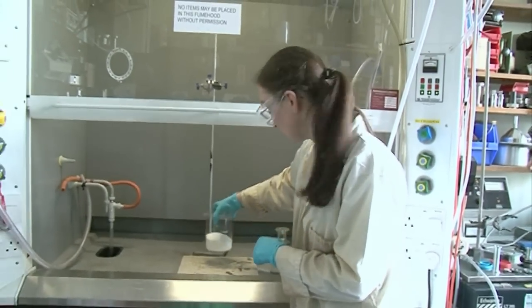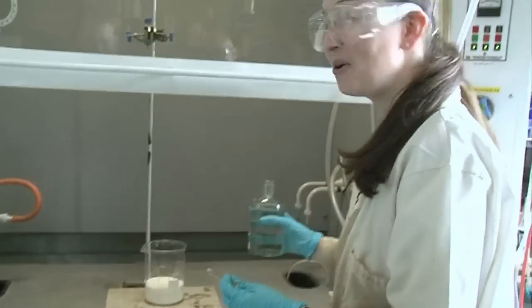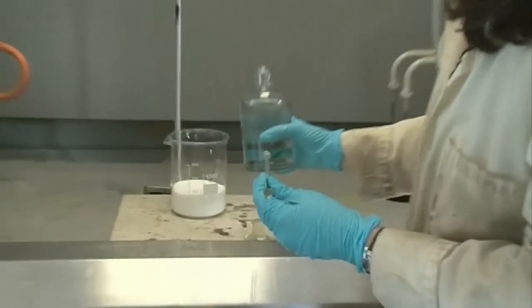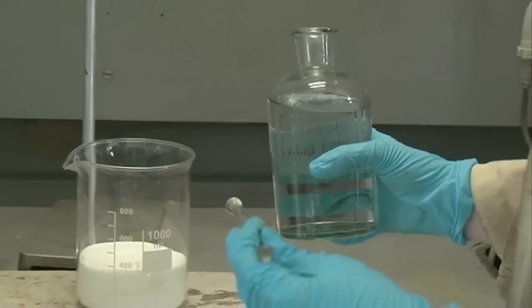I've got sugar in your fume cupboard now. Chemists use sulfuric acid for all sorts of reactions. It is the acid that you use in the batteries in cars. So what I'm going to do now is add some, I should turn it around, shouldn't I? Some concentrated sulfuric acid. Okay, I'm going to try and give it a little bit of a stir as well, to get everything nice and mixed. And pull the fume cupboard sash down, we'll see what happens.